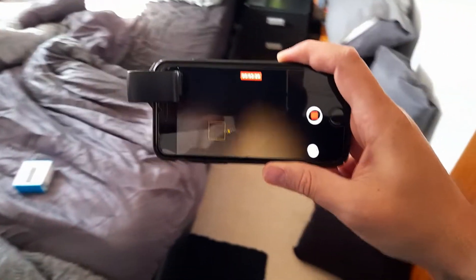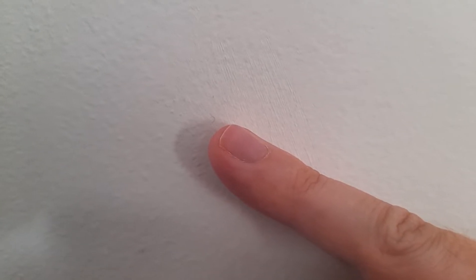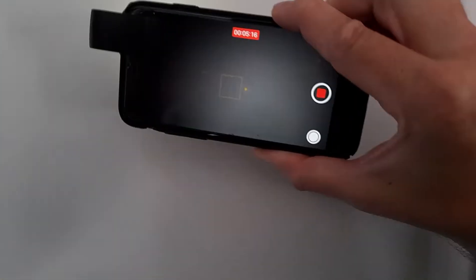Should we try it on the dressing gown? Really interesting. I'll do one more item — we'll just do the wall, see if it works on there, see what comes out. Tiny, tiny little hair on the wall. Really, really fascinating little device.